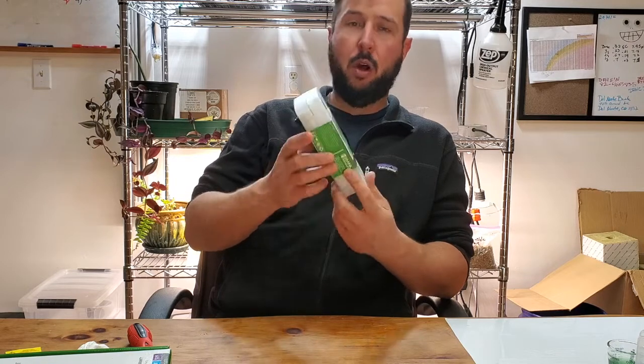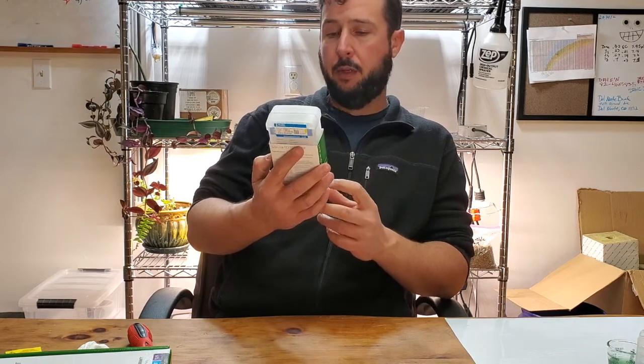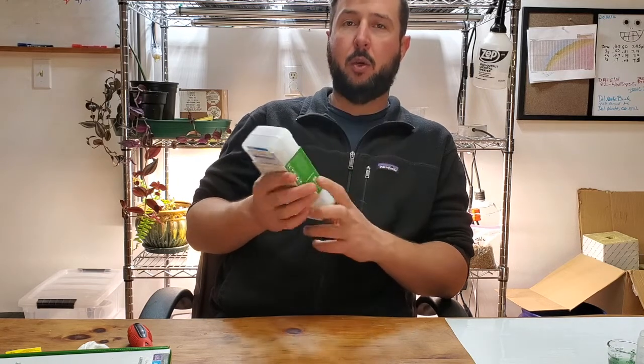The whole thing is waterproof, has automatic shutoff, automatic calibration, and I'll show you how to use the quick calibration with it.